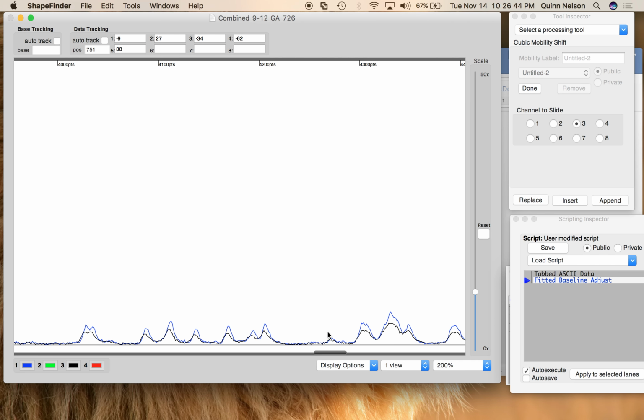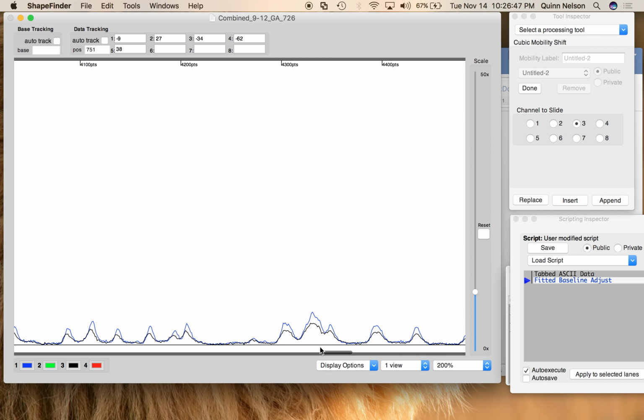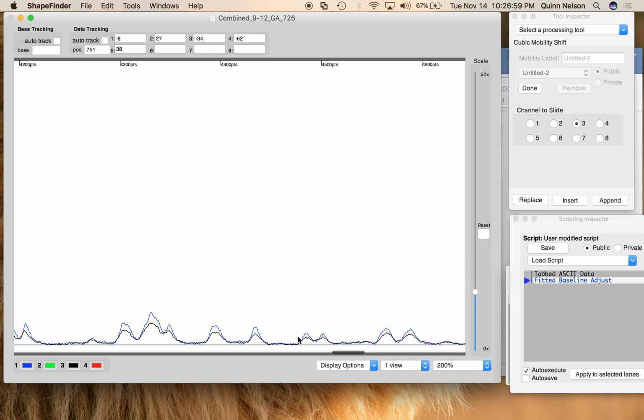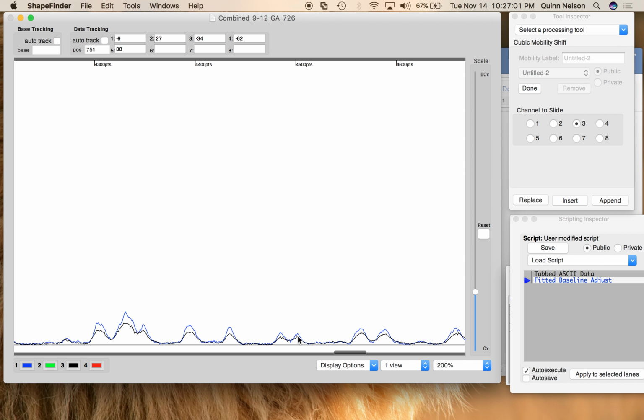And see, look at these. Wow, I don't even need to look at 4,300 here. If you want to pause and look up, this is already aligned. I don't even need to do much. So I'm just going to click and release. And so that registers in the program that, hey, this is a good alignment. So keep it here. Don't move this part.